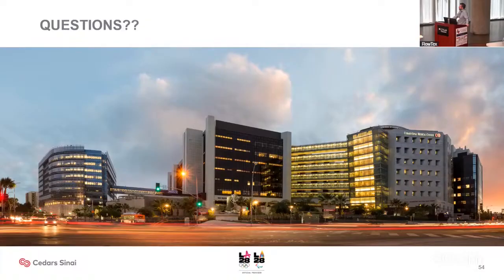you're doing this all using machine learning. You're trying to correct these artifacts that come from technical aspects like reagents that drift, instrument drift, etc. What if we put all this effort into actually trying to fix these things versus doing all this work trying to correct the lack of quality of the data?